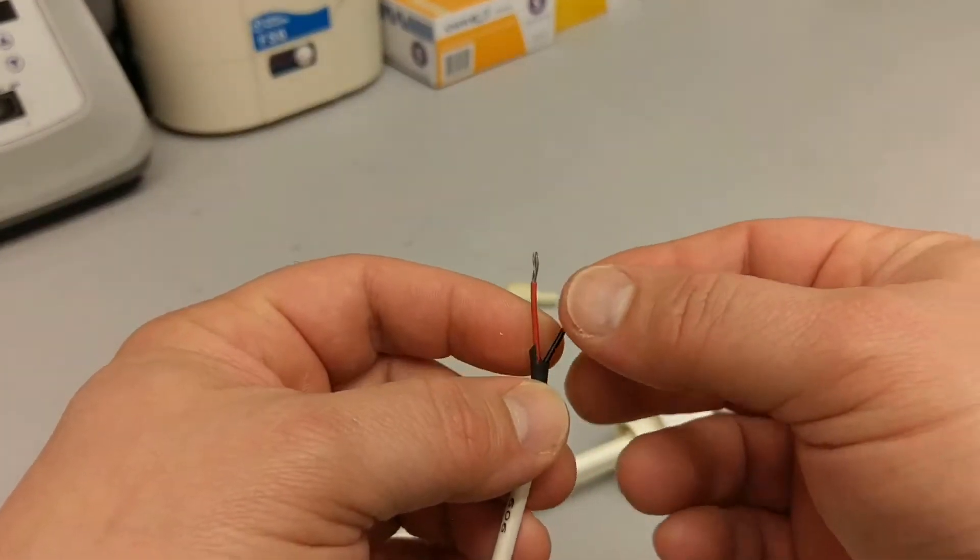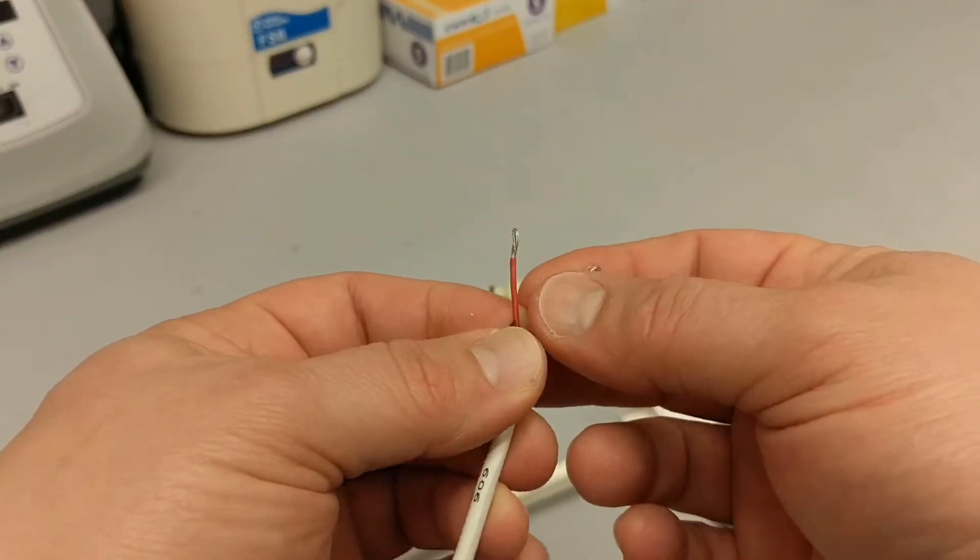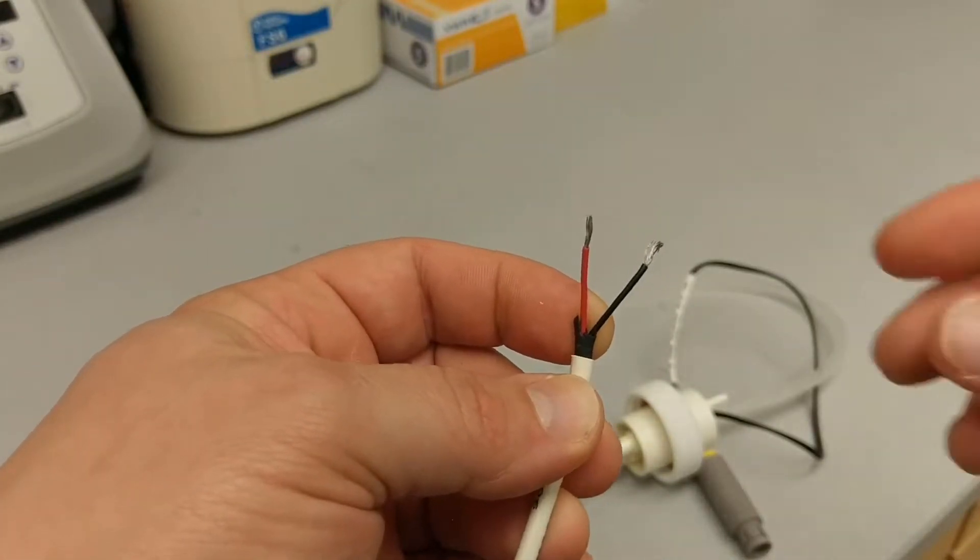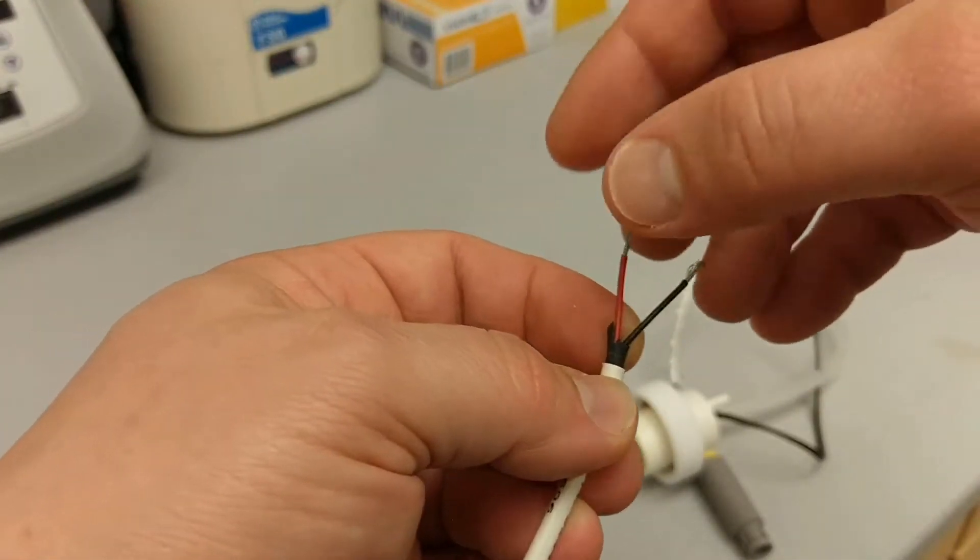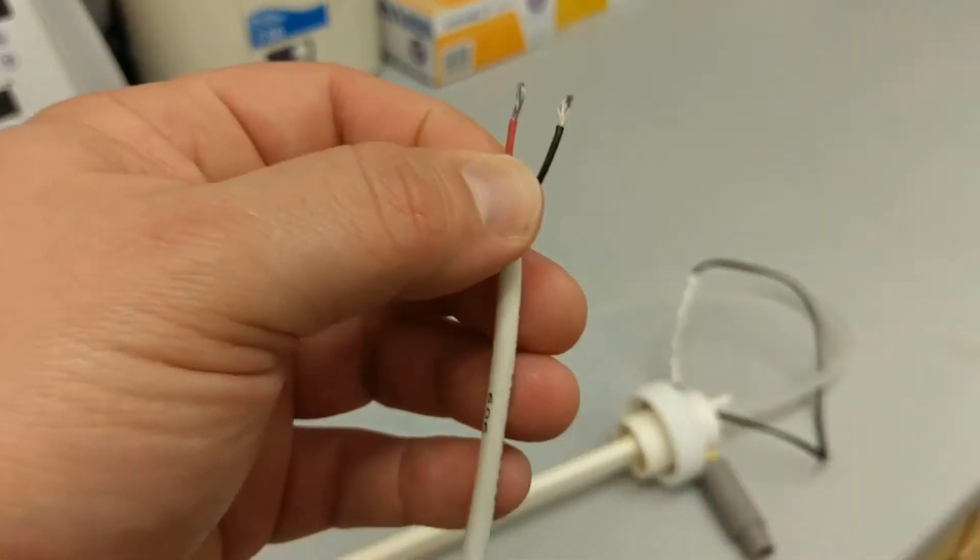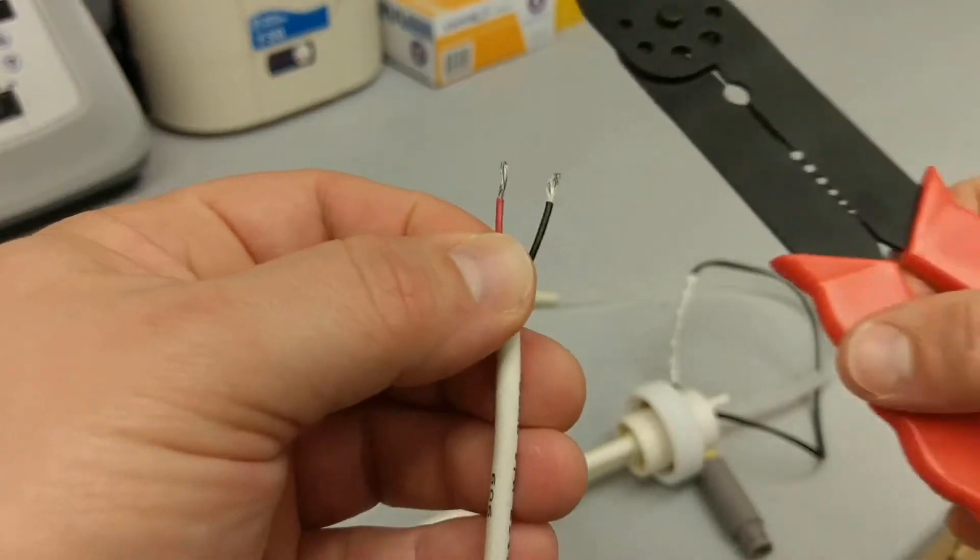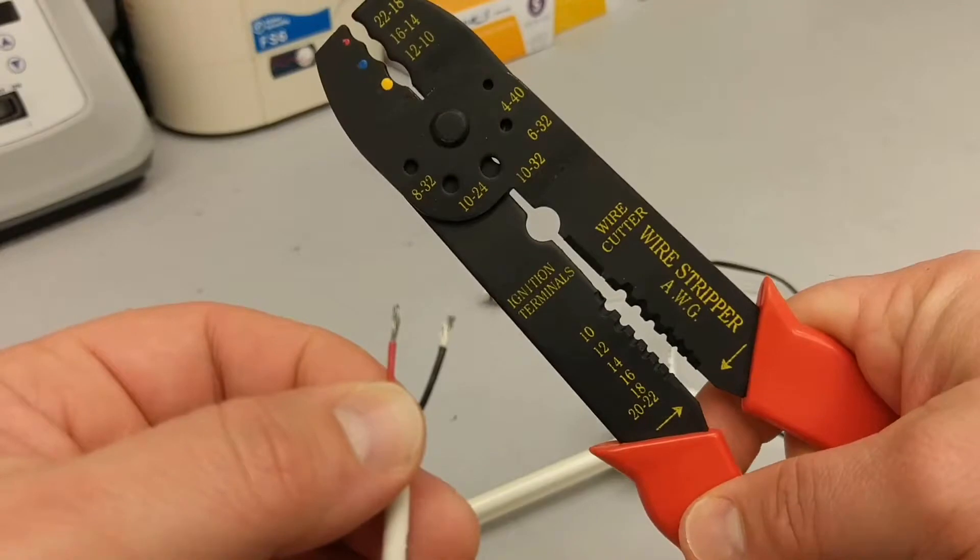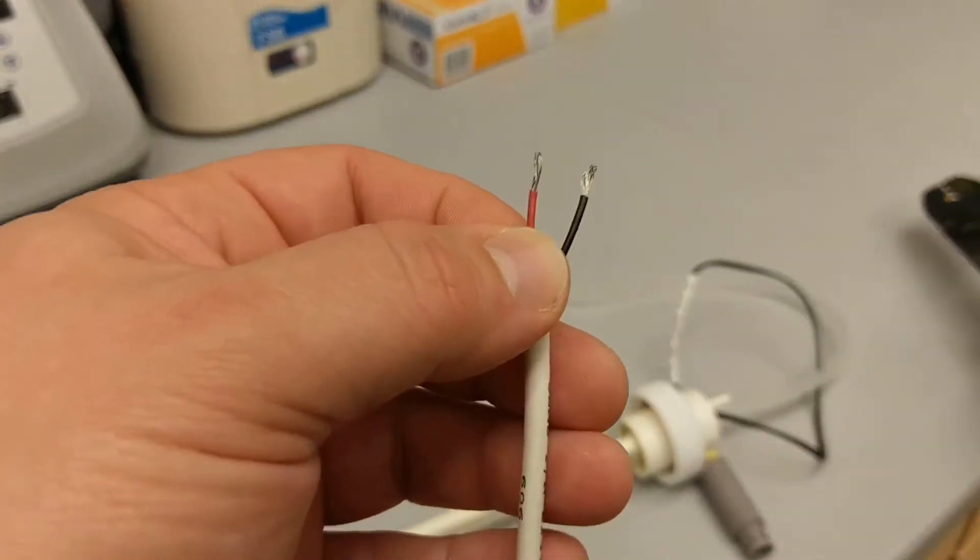And if you cut this off, you'll see that there are two wires inside here, a black and a red wire. And so what I've done to modify these is just strip the wire with, you can just use wire strippers like these, or you can even just use a razor blade if you don't have wire strippers.